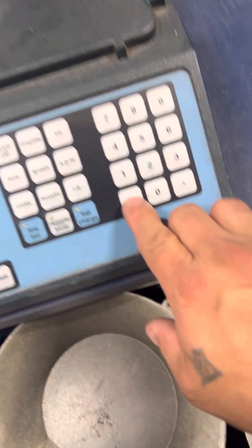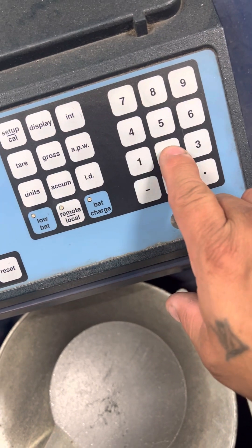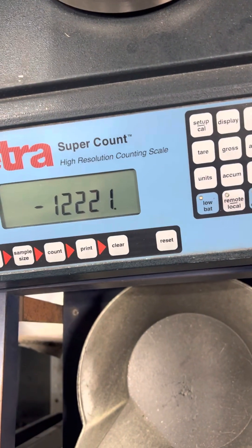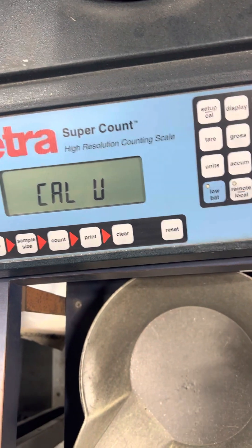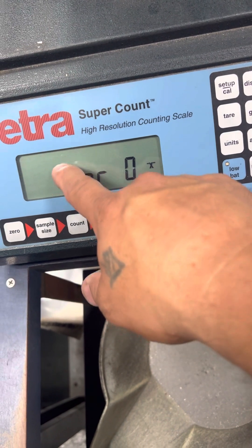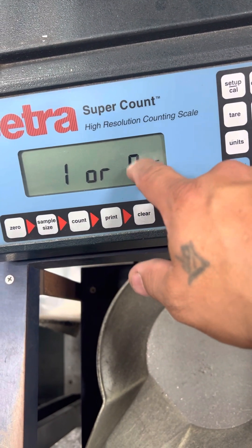So to change it, you go here: negative one, two, two, two, one. You have Setup, Setup again. Basically, number one means yes and number zero means no.